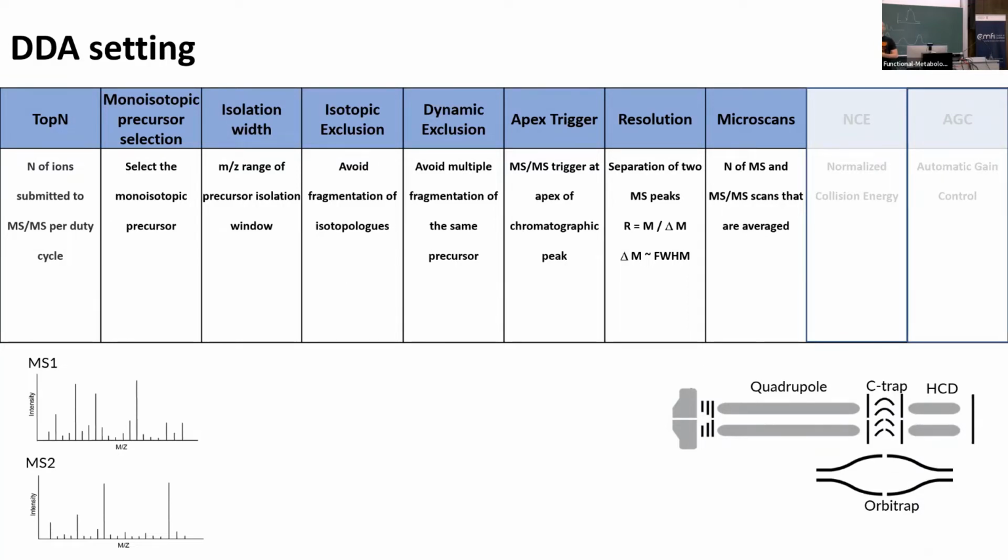If we use it for top-down proteomics, then I increase the number of microscans in order to get better signal to noise. So this is really a central setting there. And obviously, every time you double it, it also doubles the time it takes for 1 scan, right? So you cut your scan speed in half, or I don't know, 10-fold if you would increase it to 10.